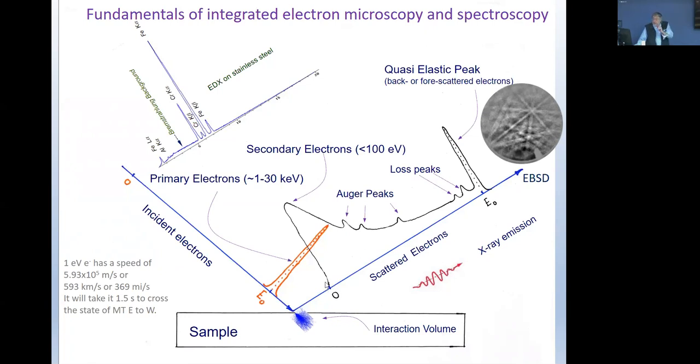The take-home message today is that some of these electrons actually come out and generate this curve. Electrons pertaining to these Auger electrons are coming from the very top surface, the first couple of nanometers. They give information about the surface, whereas these X-rays can penetrate through this thick volume and give information about the bulk underneath. So now we cover two worlds.